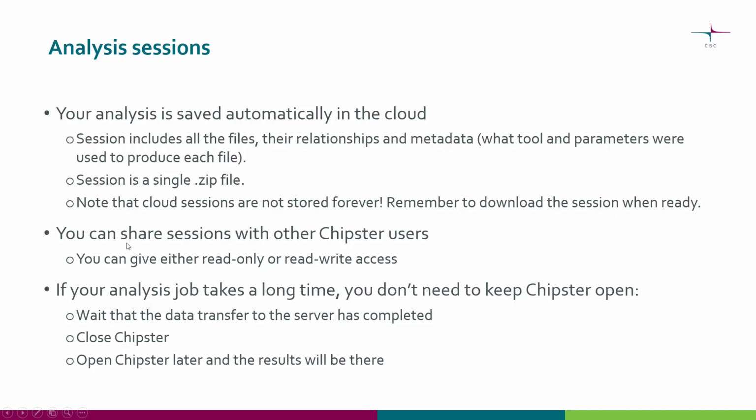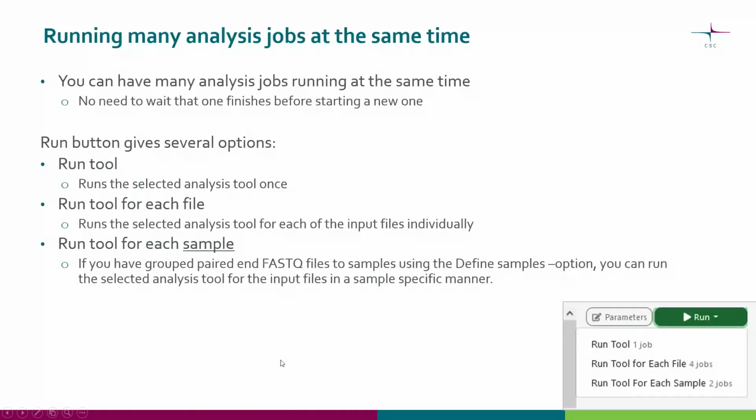As I mentioned earlier, you can share sessions with other Chipster users. You can either give them view-only access, or you can give them full rights to your session. Importantly, if your analysis job takes a long time, you don't need to wait. You just ensure that the data transfer has completed, so the data is on the Chipster server, and then you can close Chipster. When you come back later, like the next day, the results files will be there.